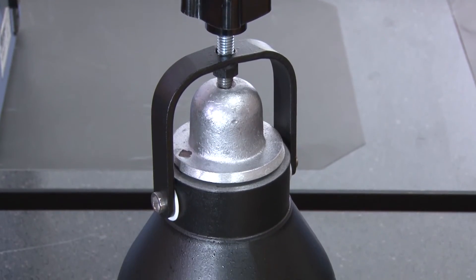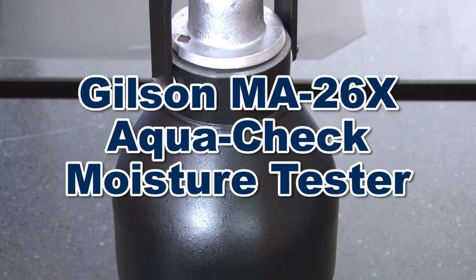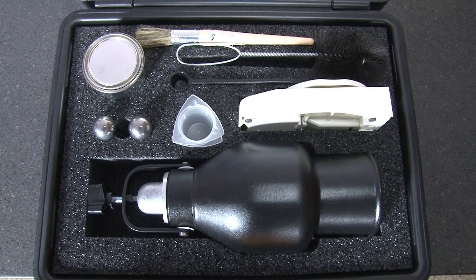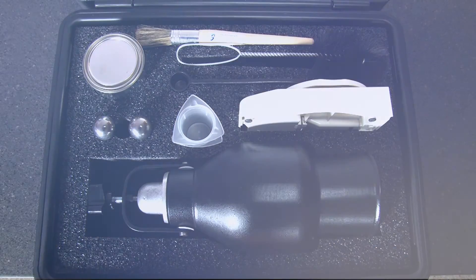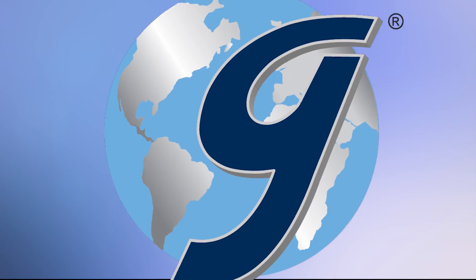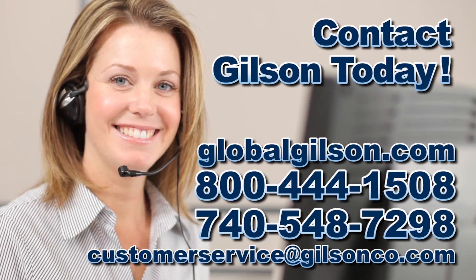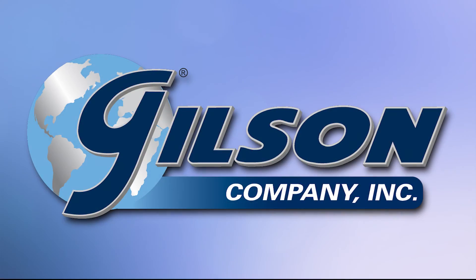Making the Gilson MA26X AquaCheck Moisture Tester the right choice for your field or laboratory testing of aggregates and soils. Be sure to check out these and all our products listed in the Gilson catalog and on the Gilson website. Gilson — your industry leader in material testing equipment.